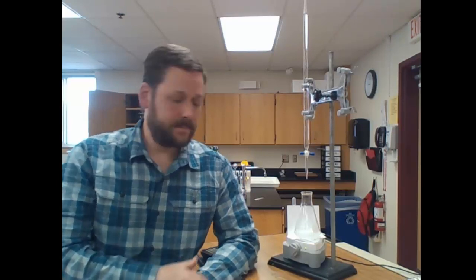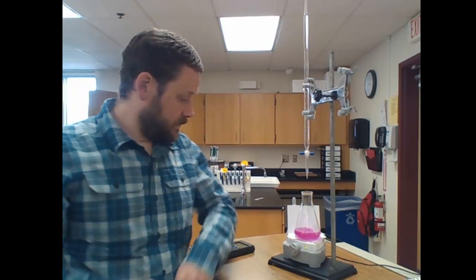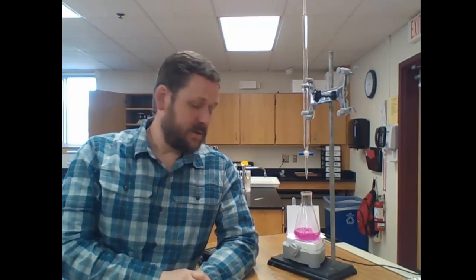Now at that point, that pink color stayed for quite a few seconds and has very gradually faded to clear. I know I'm very close to the endpoint now. If I add just another 1/10 of a mil, that pink color should stay. Now you can see you've got a very bright dark pink solution. I may have even over titrated by 1/10 of a mil, but it didn't take very much to push it over the edge.